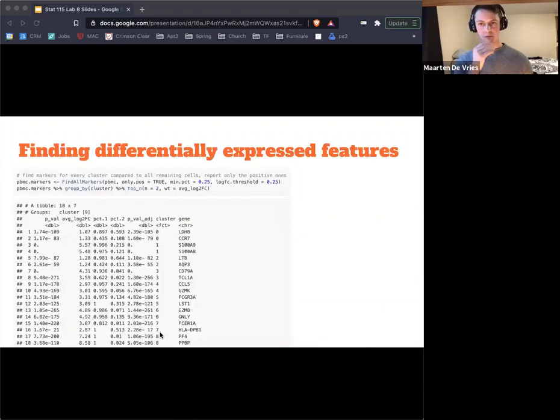Okay, so once this is all done, Seurat can help you find the markers that define these clusters via differential expression, which we've seen before too. By default, it identifies positive and negative markers of a single cluster compared to all other cells. And the function find all markers automates this process for all the clusters. But you can also test groups of clusters versus each other or against all other cells.